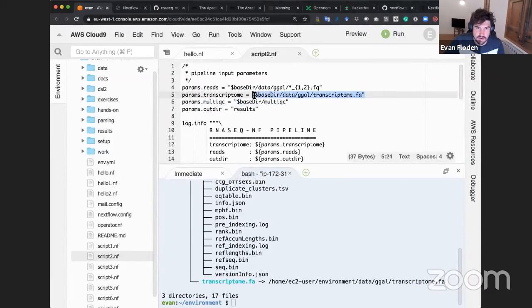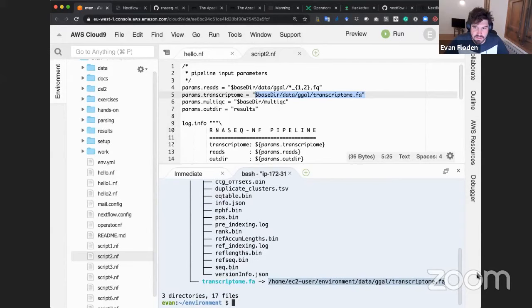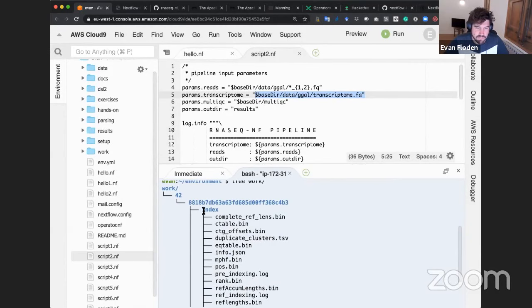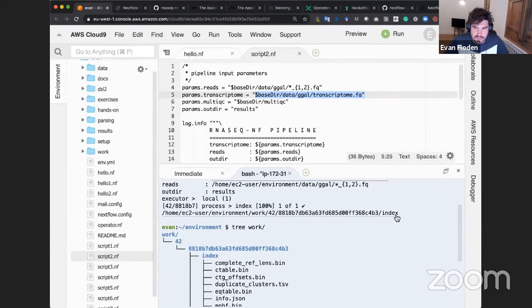So this here is the same here. So it hasn't actually copied it, it's just created a symlink on there. So this is the way that Nextflow is working: each of these tasks lives in its own working directory. The input data is symlinked in. The output data is created inside the task directory. And then the channel contains that location, in this case this file object, which will be used in the next downstream process that we have.